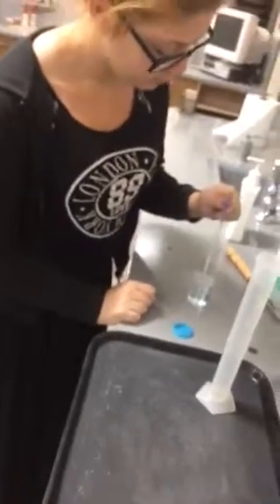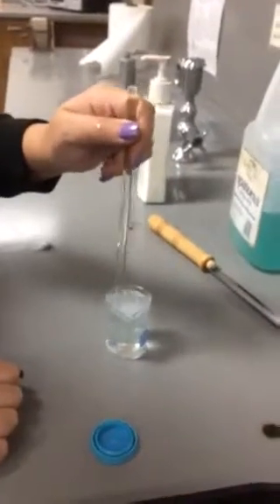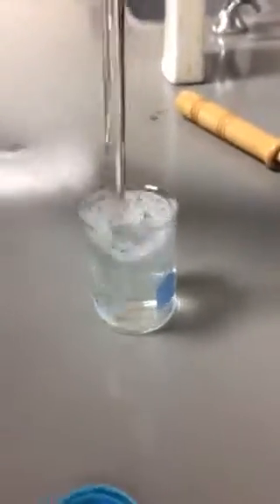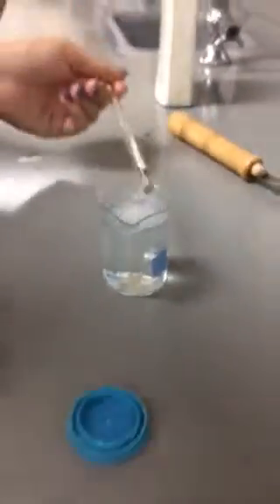Okay, now we have a stir rod out here. Glass stir rod, good. Okay, good spotting. Go ahead and stir that up, because we want that nice and homogeneous, so when we get down there, it's gonna mix in with the water and hydrogen peroxide, 30% by volume. And there we go, we're looking pretty good. All right, let's go ahead and pour that stuff in. And you'll see bubbles, but it's not from the hydrogen peroxide making oxygen.